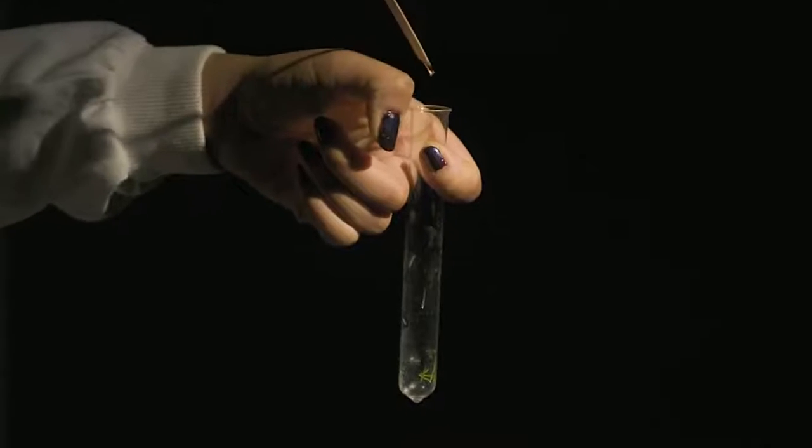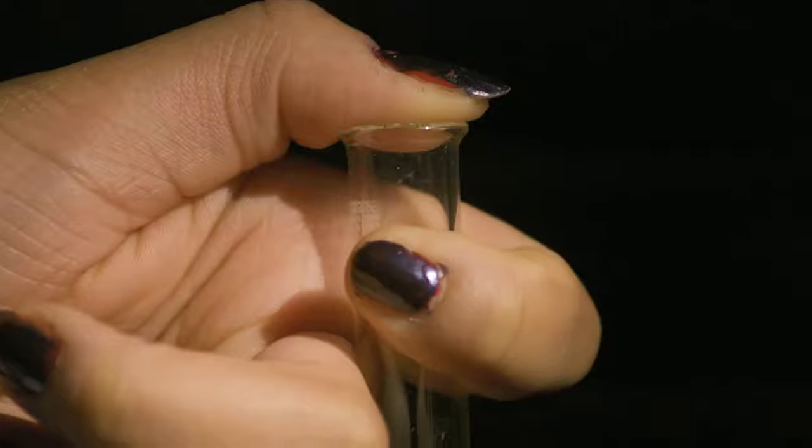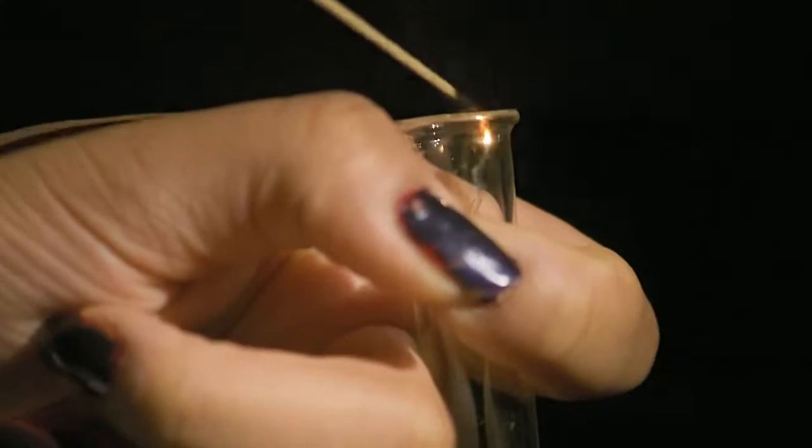By setting up some pondweed on a windowsill and collecting the gas for a few days, you can then show the students that the gas collected is oxygen-rich by reigniting a glowing splint. There are a few things that can really make a difference to ensuring that this practical is successful for all the students in the class.